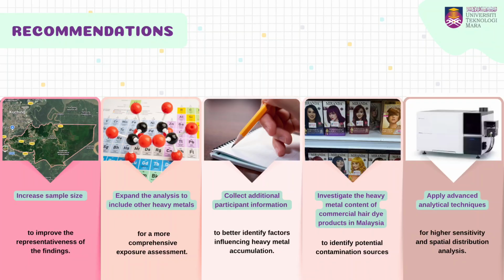different regions of Sarawak and other states in Malaysia to improve the representativeness of the findings. Additional participant information such as smoking habit, occupation, diet, and hair dye history should also be collected to better identify factors influencing heavy metal accumulation.